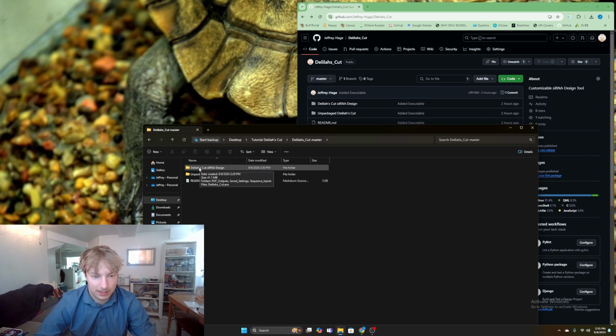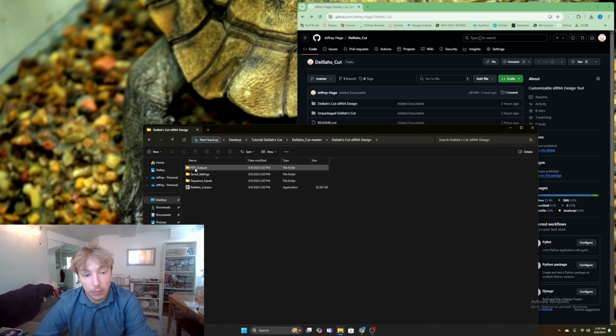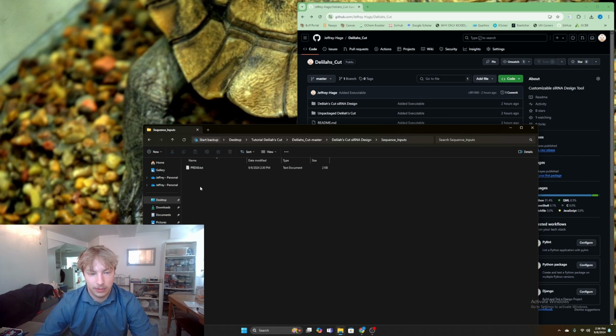So this folder, the Delilah's Cut siRNA design, should be kept together because this contains all the files that will be interacting with your exe here. So you will get your outputs as PDFs here if you wish, and your save settings, which is another great feature of this program, that you can save the settings and rerun them. So if you want to adjust them a little bit or whatever, you can do whatever you need to do. And then these inputs allow you to access specific sequences. So I have PRDX6 in here because I've worked with that in the past. And then this is some example settings, so I'll be loading that in a second.